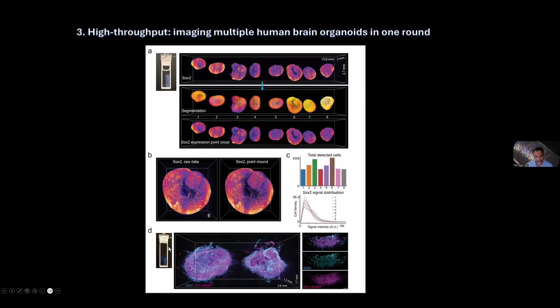This is sort of another similar example of imaging a bunch of human vasculature organoids. And so they're stained with two antibodies. So it's a two-color imaging, allowing us to kind of look at different aspects of the vasculature in terms of their connections, junction strength.